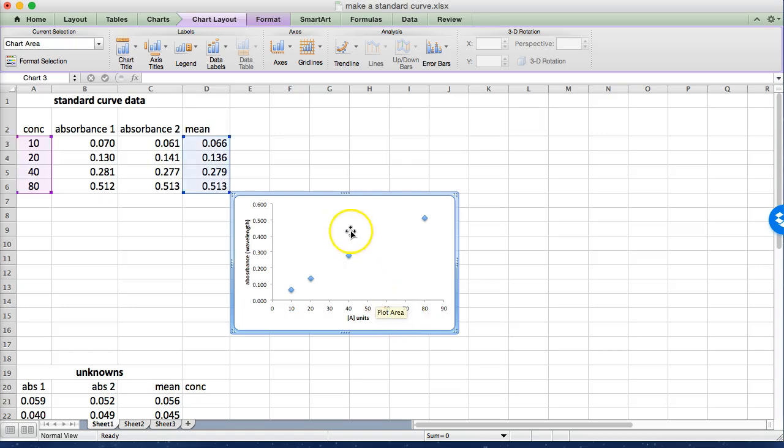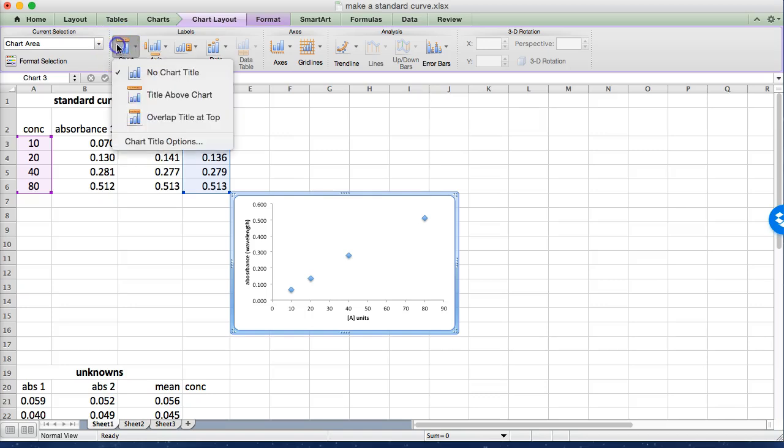Okay so you could add a chart title if you want. If you're using this in a lab report of course you wouldn't want a chart title. If you were handing in for an assignment you might. You would do that up here but I'm not going to bother right now.